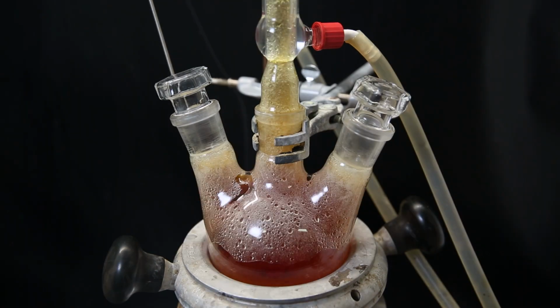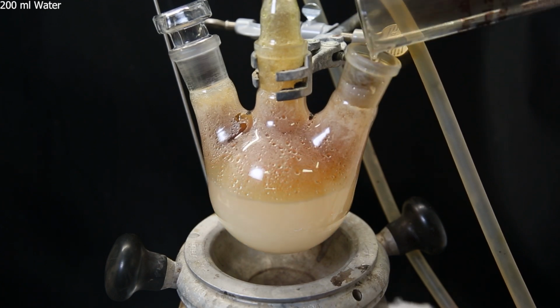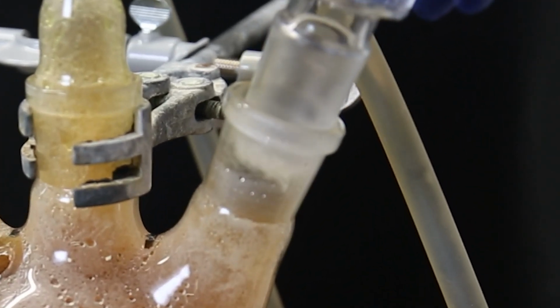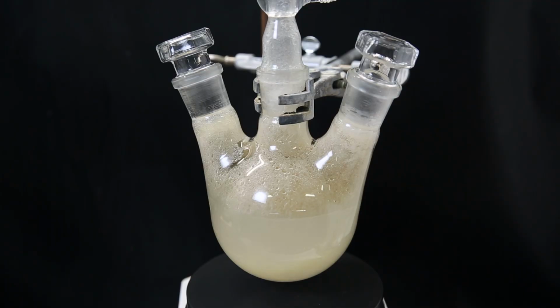When I come back the next day, some nitrogen dioxide still remains, but I can't be bothered to wait for it to disappear. So I remove it off heat and add 200 ml of water to precipitate the product. We also see some product has sublimed onto the stopper. But because it is still too hot, the product separated out as a liquid.